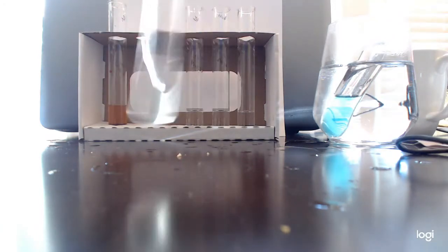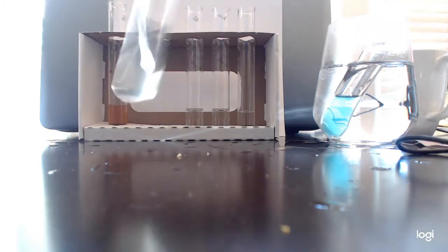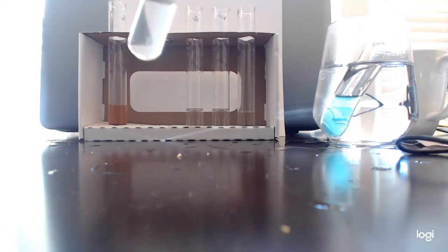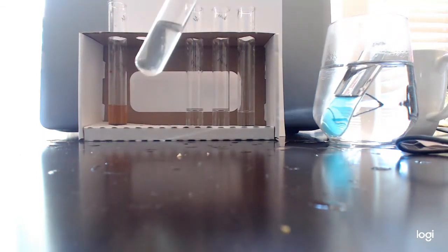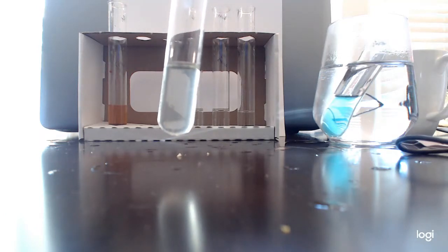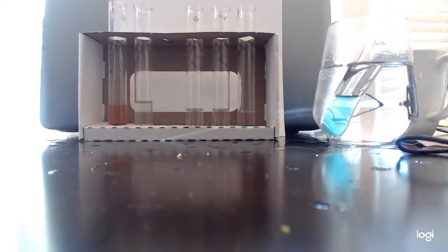This is our Biuret test. And again, we're looking for a lilac color if this Biuret test is positive for protein. And I'll stop now. You can see that that's kind of faintly bluey yellow. So is this positive or negative for protein? If you're saying to yourself that this is negative for protein, that's correct. Orange juice doesn't have a lot of protein in it.